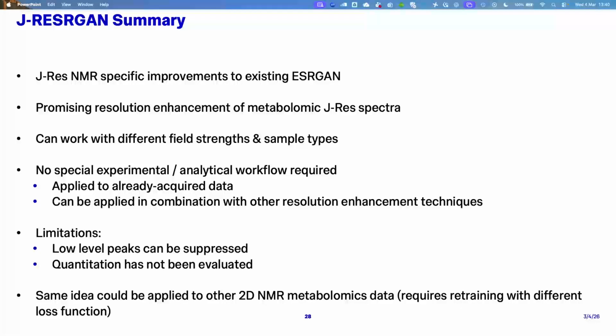An NMR person. Oh, okay. So would it give you an SNR increase, like a root-2 increase, from having that data spread out, or does that sort of count for that anyway? Well, the same amount of information is there, right? I don't know for sure off the top of my head. I think you are fitting double the amount of data in some way. So I would imagine that in terms of signal to noise benefit, you're not going to gain anything, because in one way you're just adding together those random errors, and in another way you're fitting double the number of data points. So my guess is that you probably wouldn't gain anything.